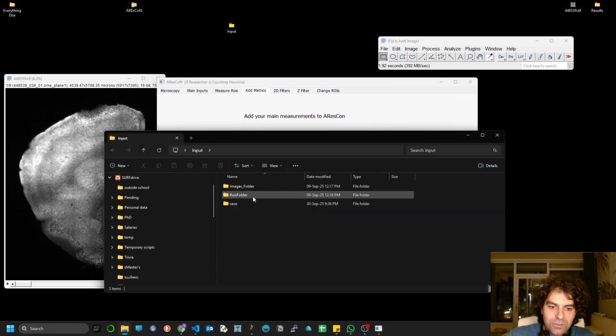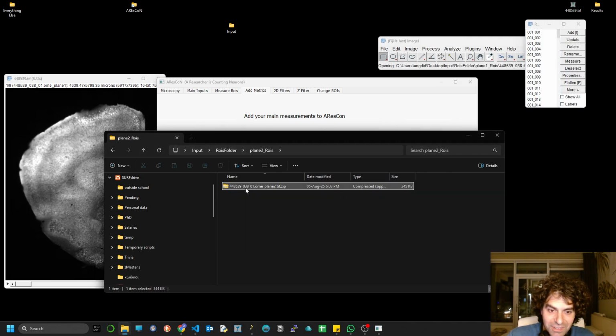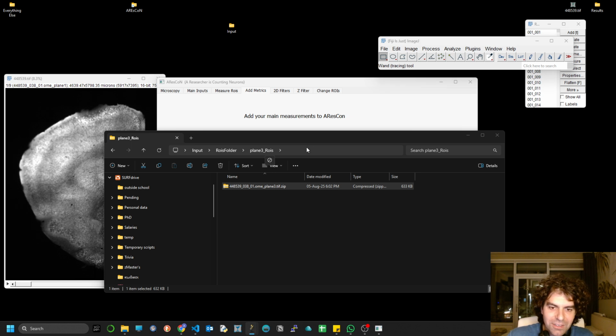And what I'm going to do next is that I'm going to load a lot of rows. Okay, and that's really a lot of rows. Actually, it's even becoming heavy for my computer for some reason. Something has lagged. I think you can still see me, but my computer is struggling right now.